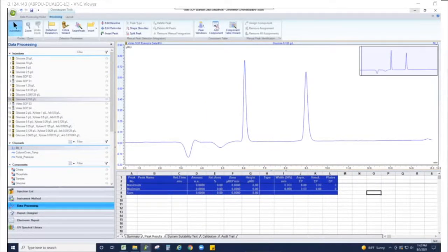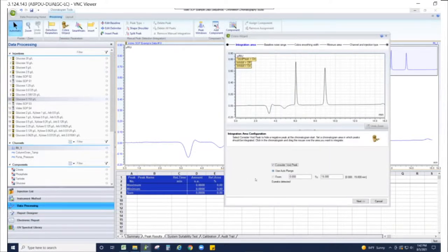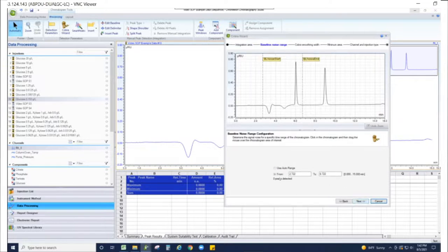Select the injection and channel you want to evaluate. To begin peak detection, set your detection parameters using the Cobra Wizard. Follow the prompts to define integration range, baseline to noise range, Cobra smoothing width, and minimum area of detection.